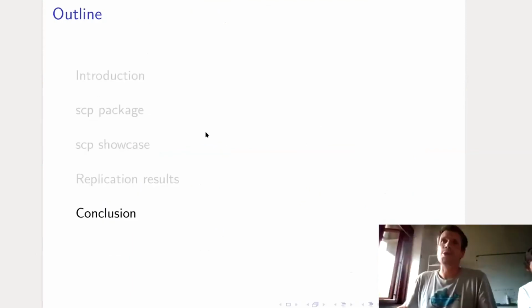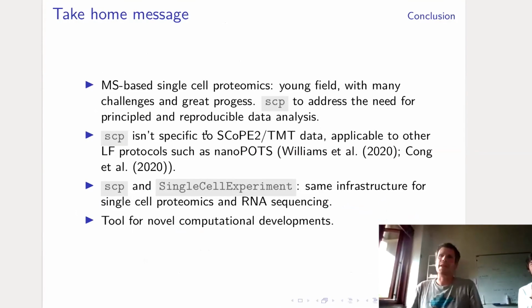Okay, thank you very much. So let me conclude this talk by highlighting our main take-home messages. I think we are all here because we are excited by mass spectrometry-based single-cell proteomics. But we are, of course, all well aware of the challenges. And with SCP, we hope to address the computational part of these challenges by providing a principled and reproducible data analysis framework to manage the data, to analyze the data.